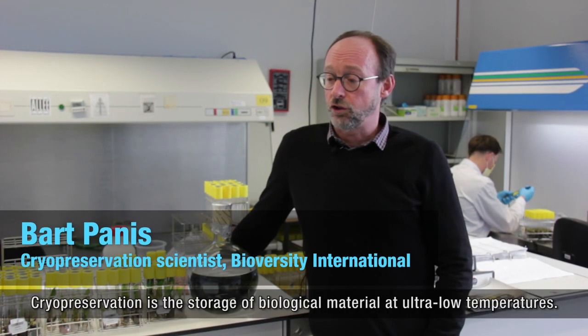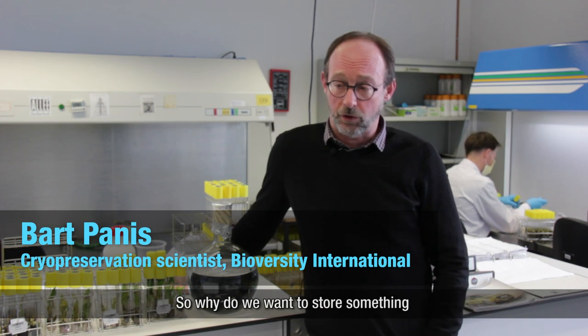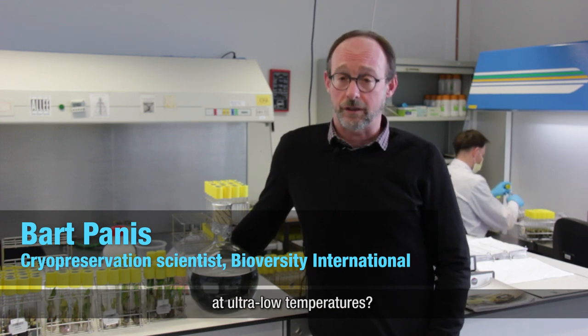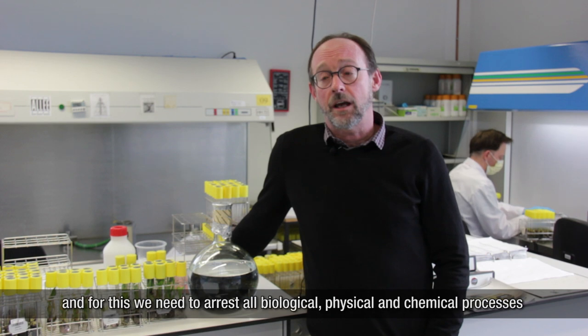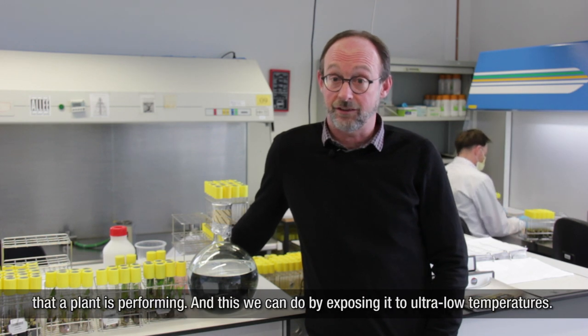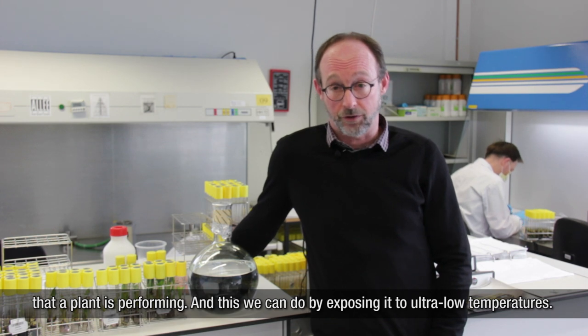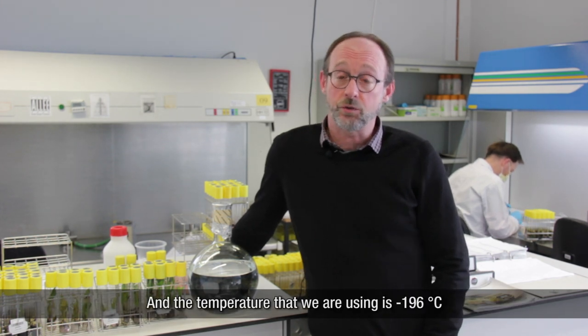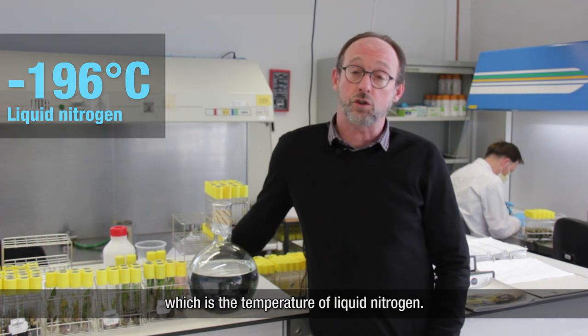Cryopreservation is the storage of biological material at ultra-low temperatures. The main reason is that we want to store something for long times, and for this we need to arrest all biological, physical, and chemical processes that a plant is performing. This we can do by exposing it to ultra-low temperatures — minus 196 degrees Celsius, which is the temperature of liquid nitrogen.